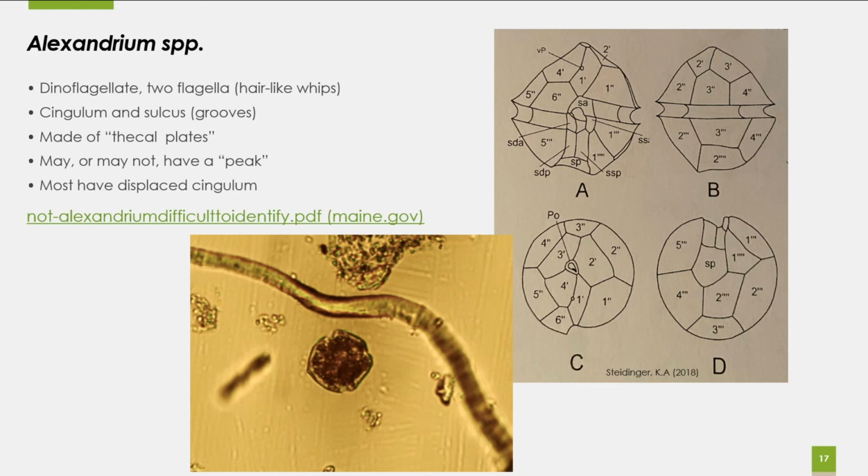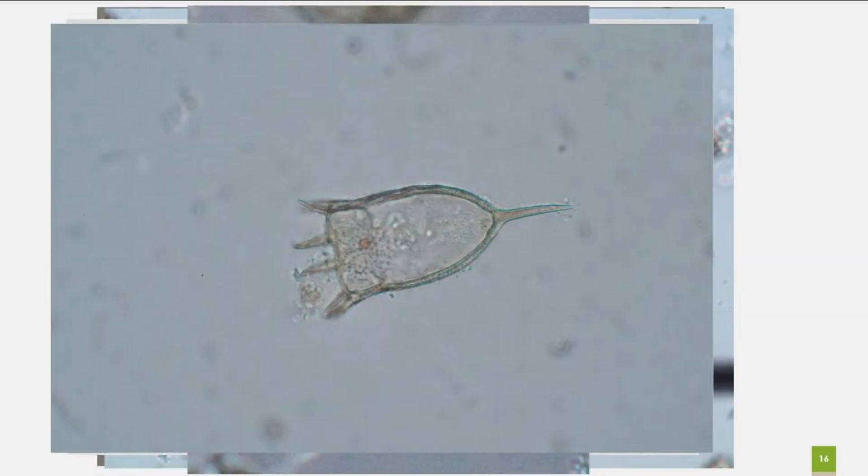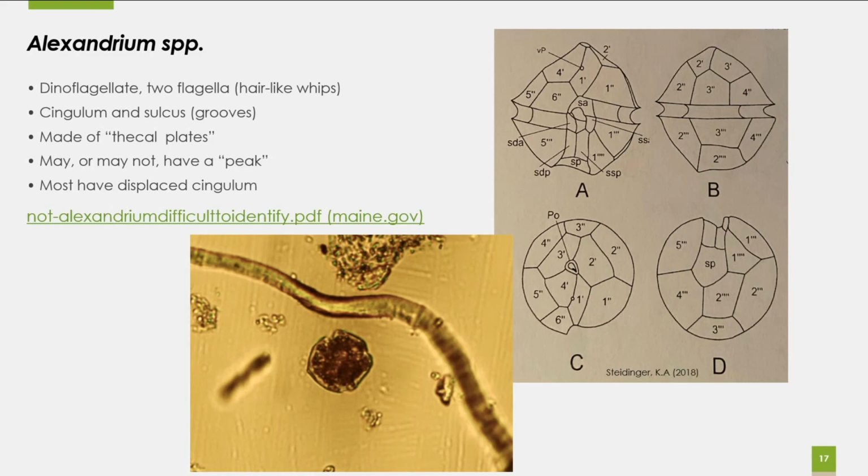Like that last species you just presented had a clear sheath around it. Does Alexandrium ever have that clear sheath? At least in my guide, it looked like there was a clear, kind of opaque layer. Oh, like in the Scrippsiella one? Yeah. I don't think so. Well, I don't know, because I've seen some cells that kind of look similar to that and that we thought were Alexandrium. But typically, my answer to you is, it could be.